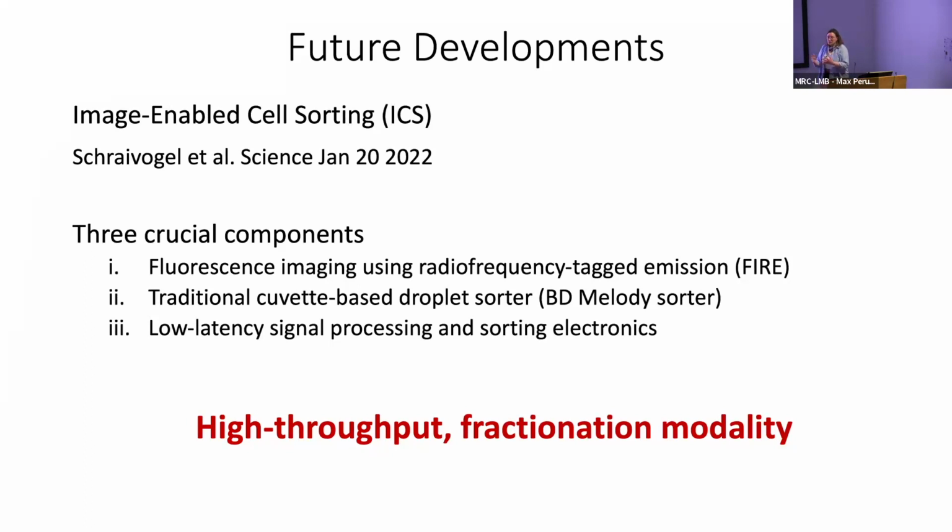That can be anything from mass cytometry, where you incorporate elements of mass spec with cytometry. But one of the most exciting changes in the field right now is overlapping imaging with sorting, and imaging specifically with flow cytometry.